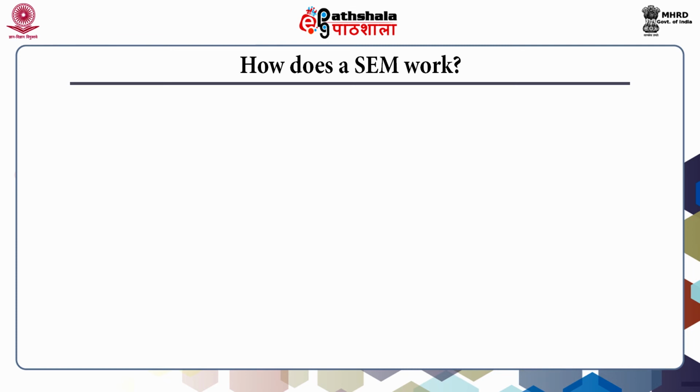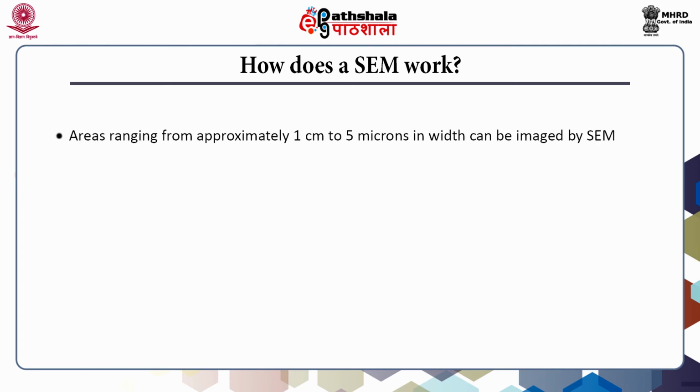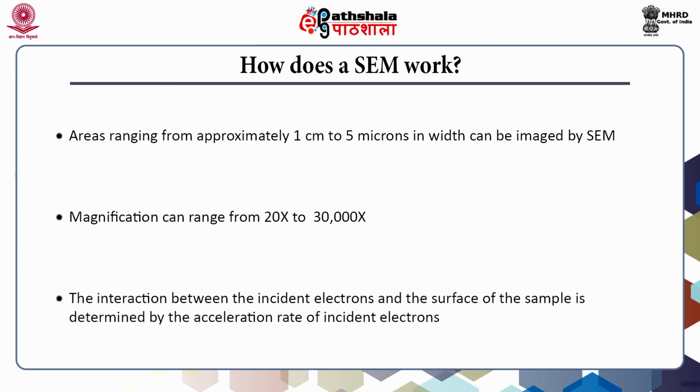It is important to note that areas ranging from approximately 1 centimeter to 5 microns in width can be imaged by scanning electron microscope with a magnification ranging from 20x to approximately 30,000x. The interaction between incident electrons and the surface of the sample is determined by the acceleration rate of incident electrons.